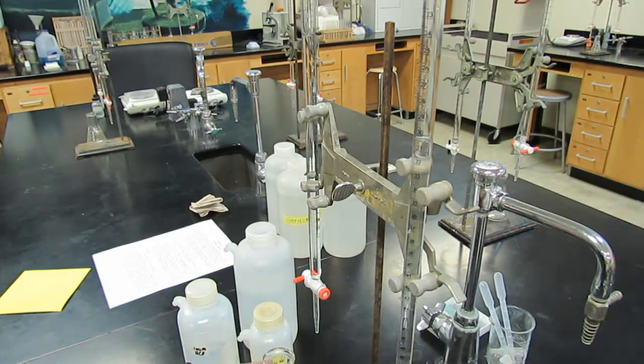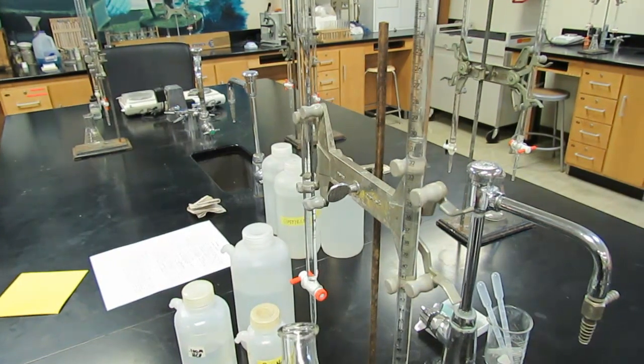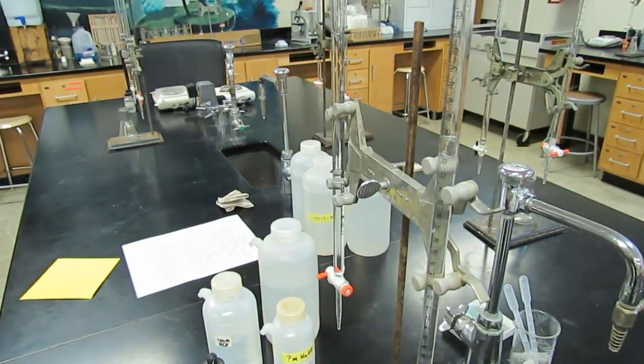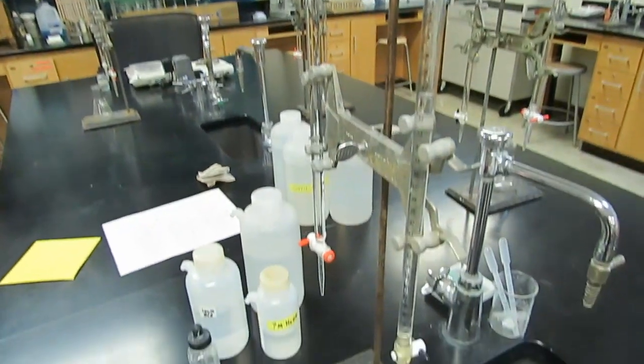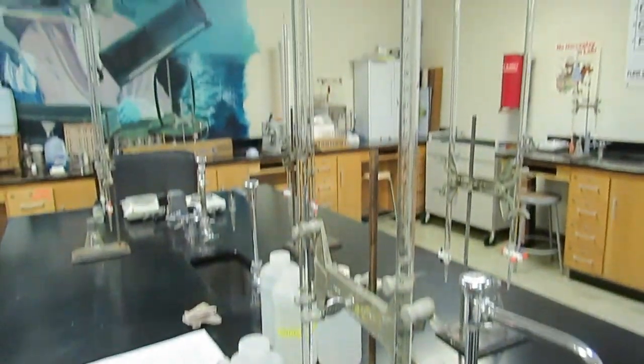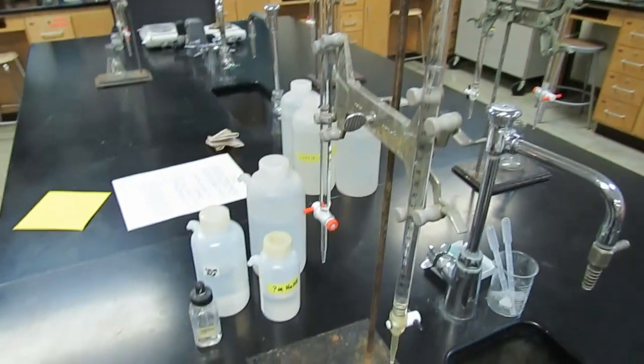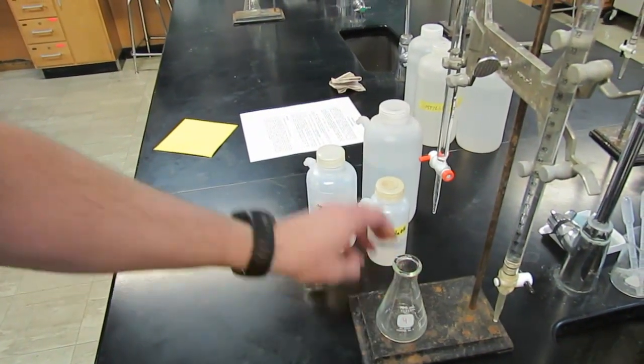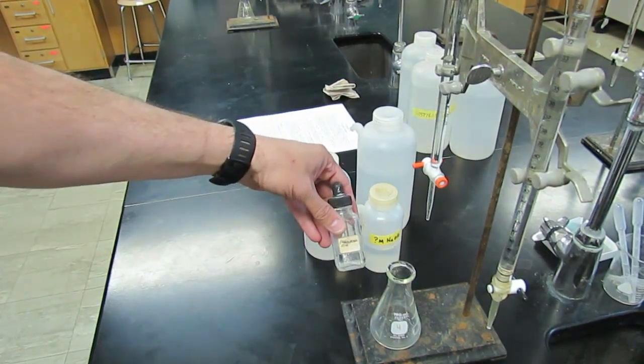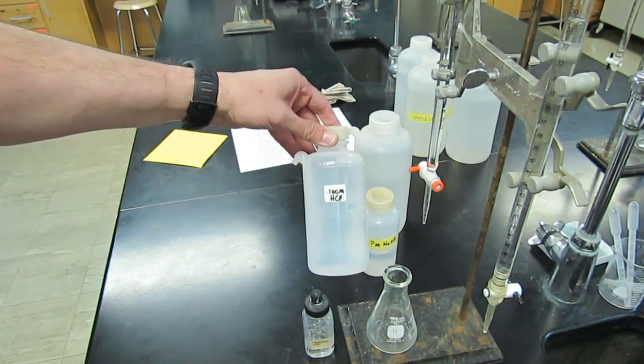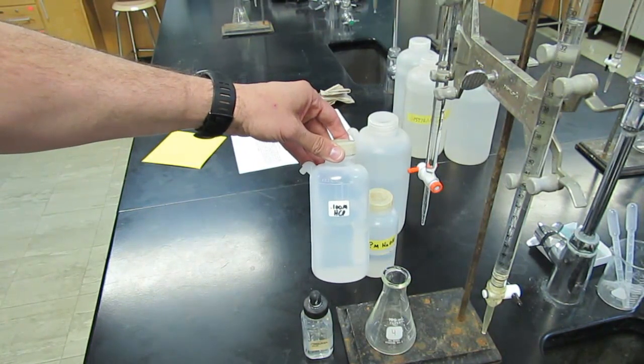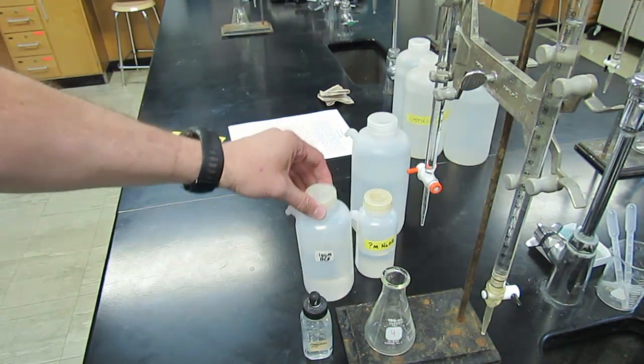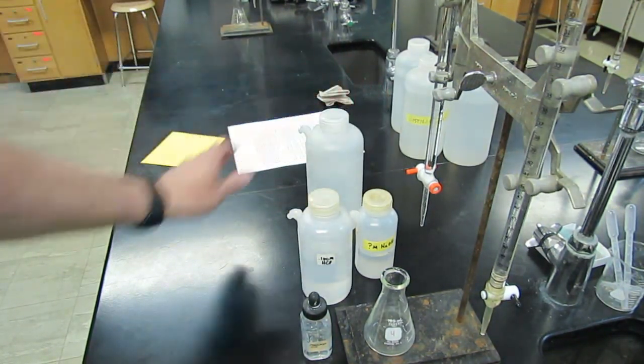Welcome. Today we're going to be doing an acid-base titration. We have some pretty standard equipment here. We'll be using these burets. We'll talk about how those are used during the experiment. We have a 125 milliliter Erlenmeyer flask, some phenolphthalein indicator, some 0.100 molar hydrochloric acid, and a bottle of distilled water.